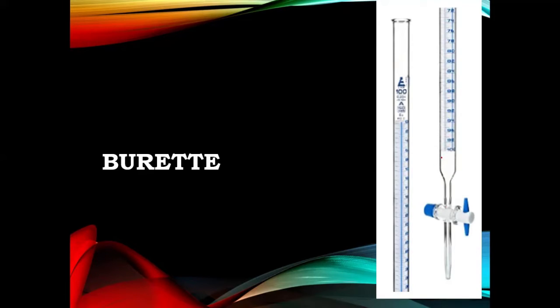And during titration, this whole tube must be filled with the required or desired liquid, either a base, an oxidizing agent, or an acid, whatever is in the burette. The least count: what is the least count? The minimum reading that can be taken. So the least count of the burette is 0.1 ml, or you can write it as 0.1 centimeter cube.